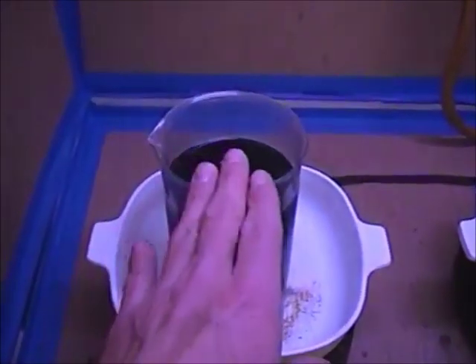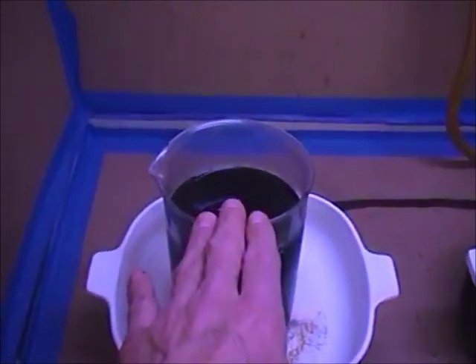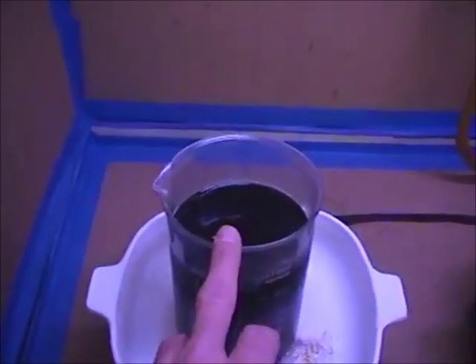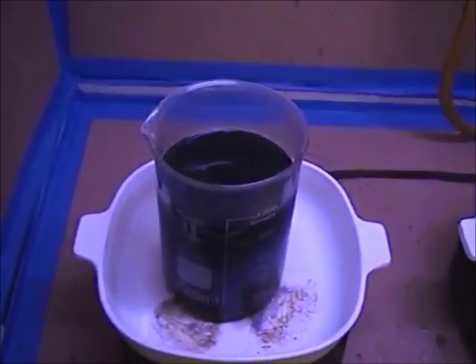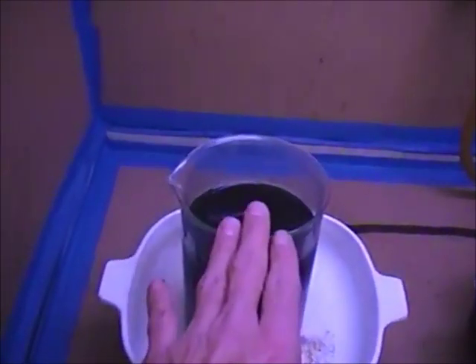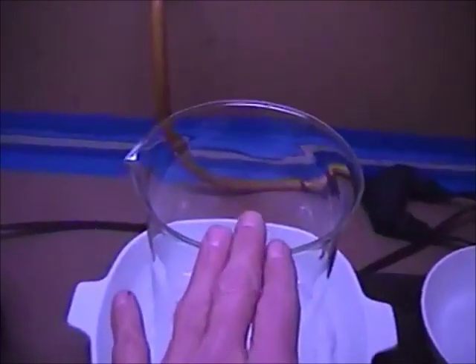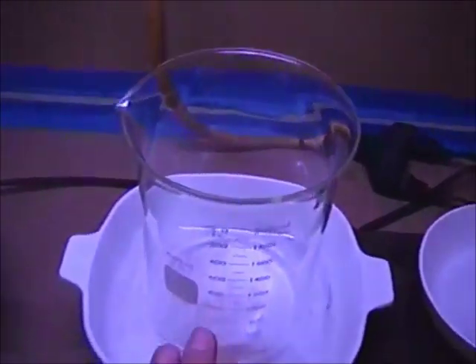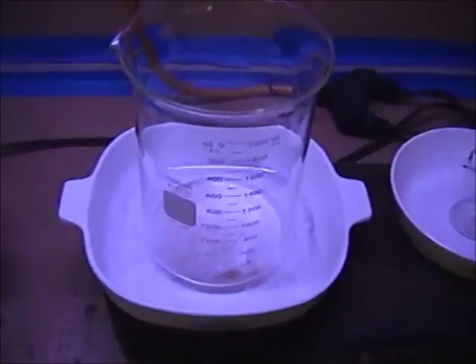So I'm going to warm this up to room temperature, because that's the temperature I want it to be at for the most metals to precipitate out of this solution. As soon as I get this up to about 72 degrees, I'm going to pour it over into the 2,000 milliliter beaker, and that is where we're going to start adding our sodium hydroxide, and then we're eventually going to add our sodium formate after we do our filtering step.